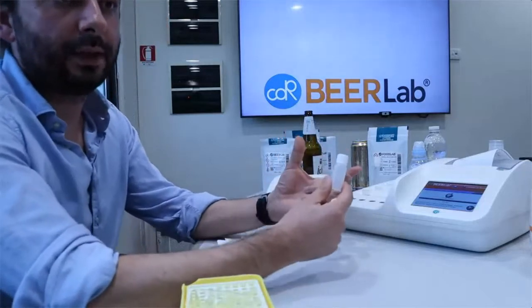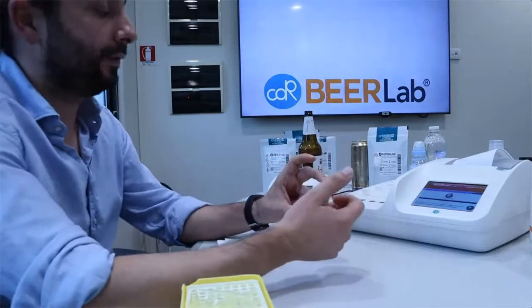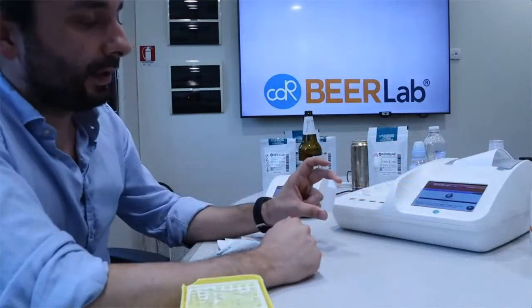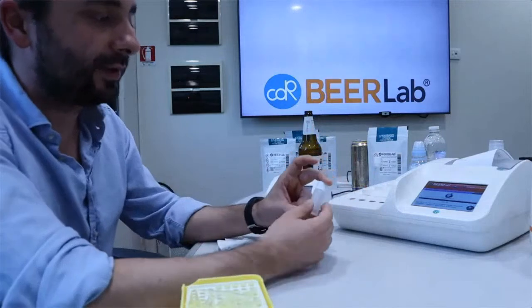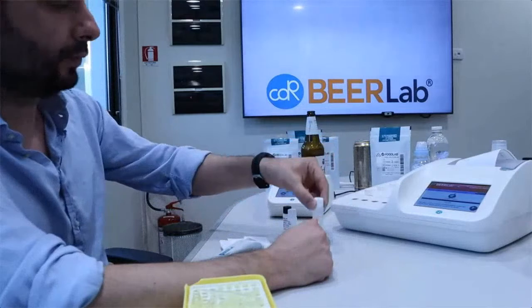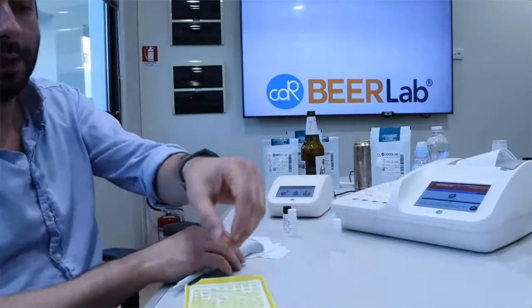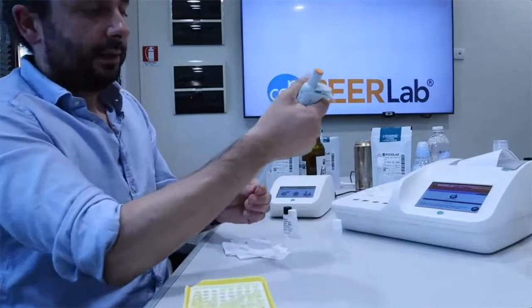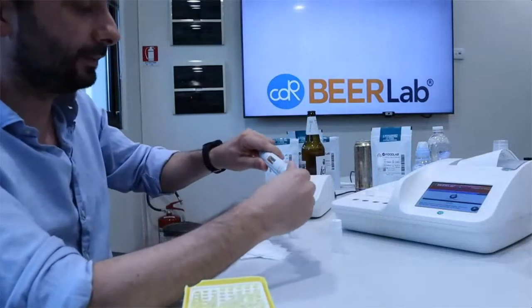In the alcohol kit, you have a vial like this. After the degassing, you take the 100 microliters, you put these 100 microliters in, and you have your diluted sample. After that, we can start running the analysis. Okay. So we take the pipette. We select 100 microliters.